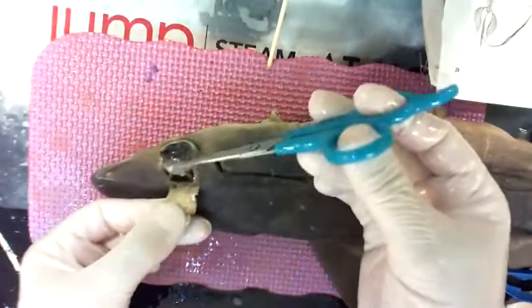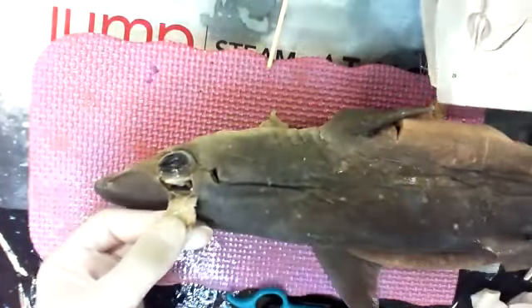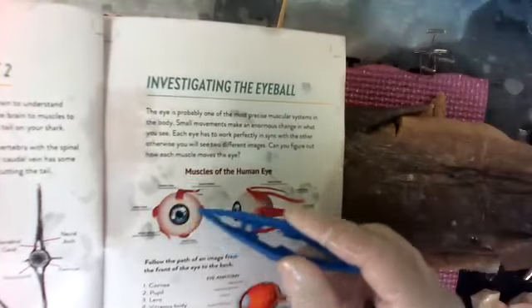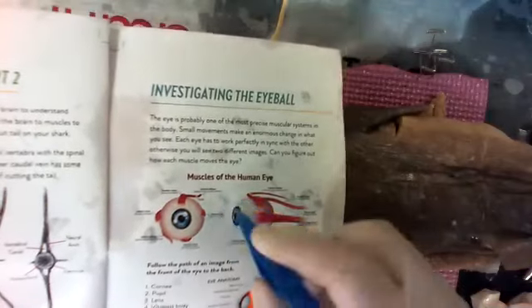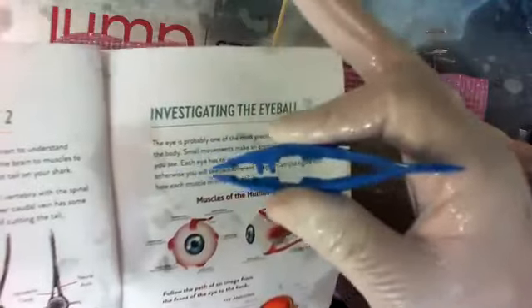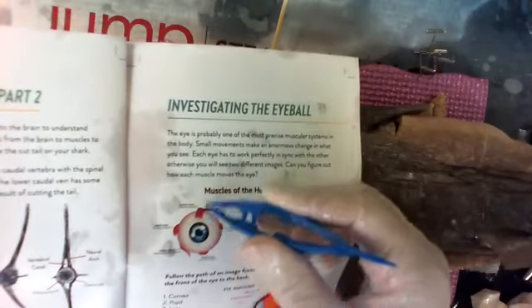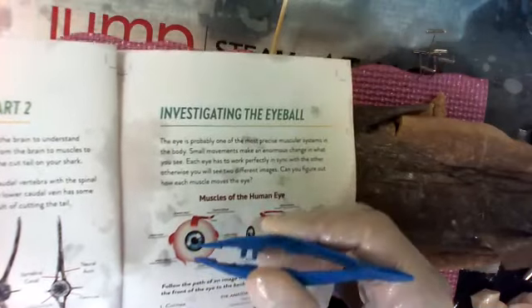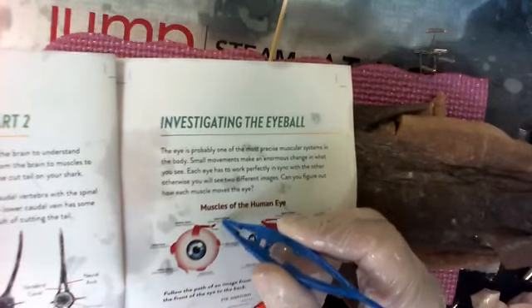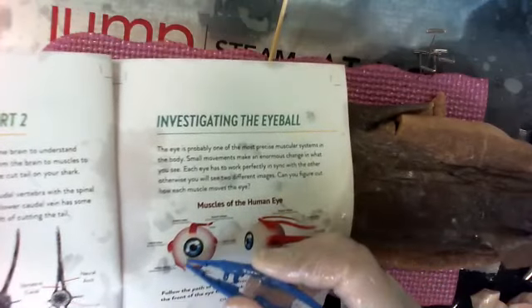Can you see behind the eye? I can see some muscles. If you look at this book, and this is one of the cooler things about the eye, you've got 6 muscles. You have one on each side, a left and a right. We call those the laterals. Well, lateral and medial. This one sits out towards the outside edge of the body laterally. This one would sit closer to the middle because it's medial. You have a superior and an inferior, one that goes to the top, one that goes to the bottom. Recta means straight. But then you also have ones that are oblique. They go at an angle, diagonally. So you have 1, 2, 3, 4, one diagonal here and one diagonal here.